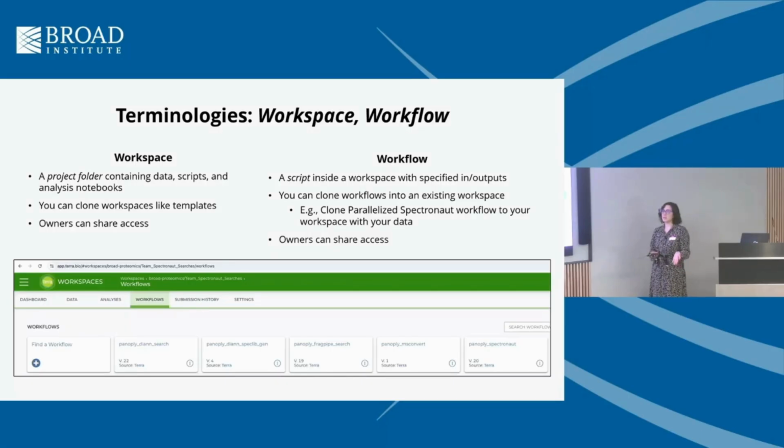A workspace you can think of as your project directory, like a folder on your desktop. This is a space that's going to host all of your scripts, all of your files, and everything that you need to actually run your jobs and get your results back. A workflow is a script inside your workspace. This is how you are actually going to execute the Spectronaut search, through using a workflow within your workspace. And the nice thing about workspaces is that they are shareable between different users.